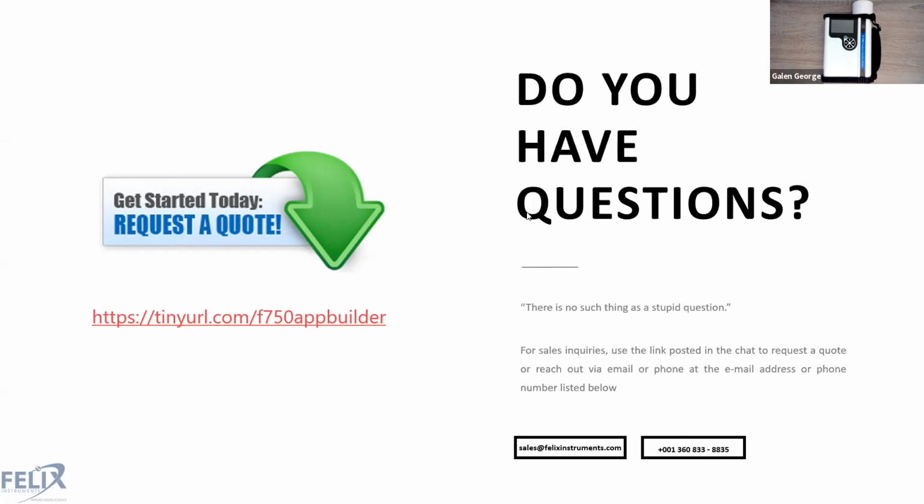So what it does is wrap up all those DAT files that you just collected. Maybe you took 100. If every 100 scans you're done with your bin, you want to archive that bin, or maybe it's just, I'm done for the day, I want to archive this day's worth of measurements. It'll wrap all those up into one folder and put it on the SD card so everything's clean.